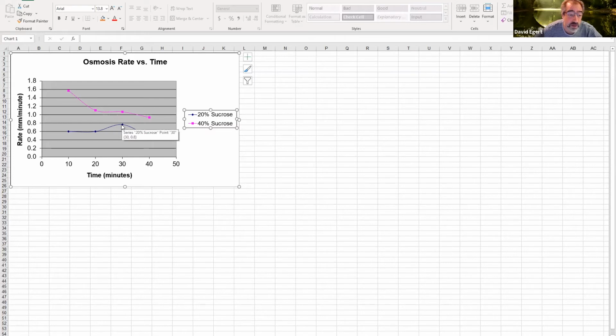I'm sure it's one of the sources of variability that is responsible for that. It's normal that your data has some weirdness that might be real or might not be real. A lot of times it's not real. The term we use for things that show up in your data but aren't related to a real effect is an artifact.